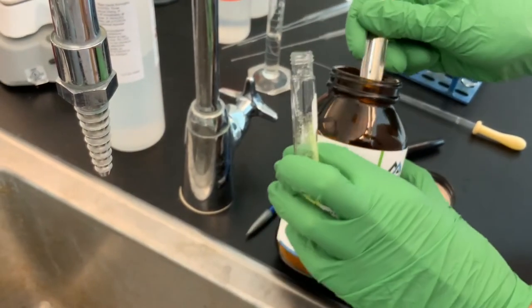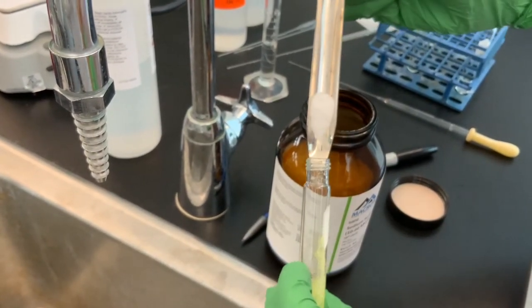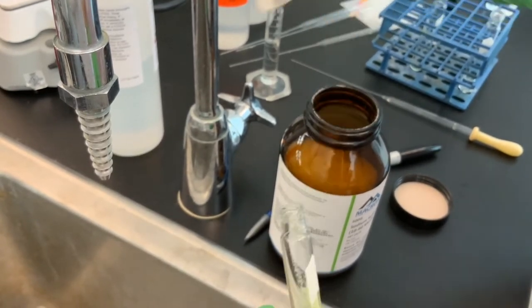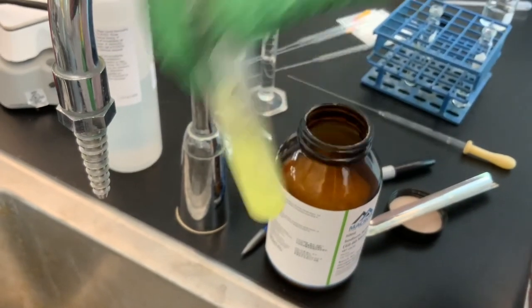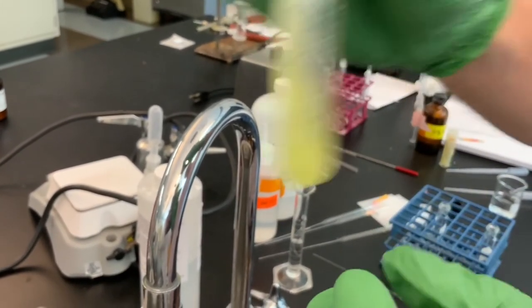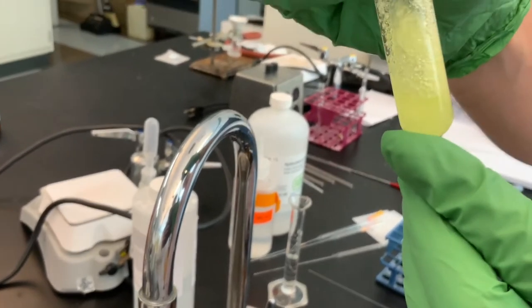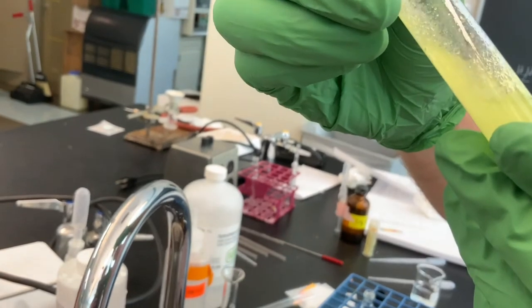And don't worry about it overtaking everything, because we're going to rinse everything with methylene chloride until we get rid of all of the yellow, so that we know we've got a quantitative transfer of 9-fluorenone. Right, because at this point, I really don't have much volume to be working with. So I'm going to rely on the column of sodium sulfate to get rid of any remaining.